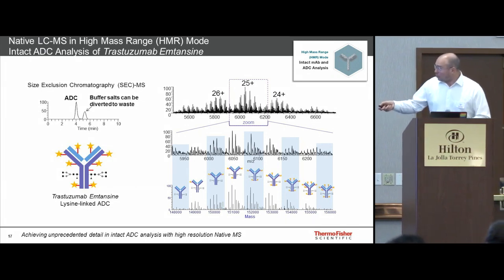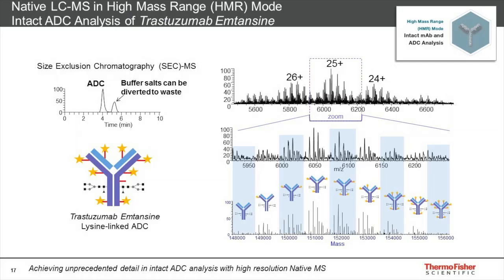As we look at this spectrum, if it's our job to do this analysis, we have to do the deconvolution, but at the end of the day, we have to ask whether this deconvolution result looks right. That's the challenge of somebody who does intact protein analysis. By preventing the situation where we have this much overlap and complexity, and moving to something with little to no overlap, we can compare that to the deconvolution result.